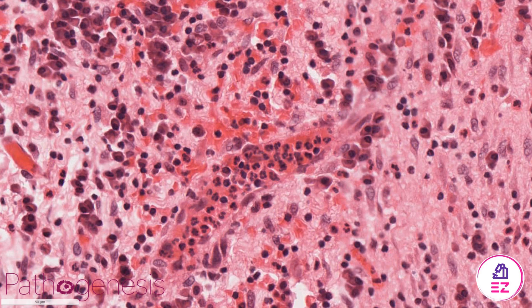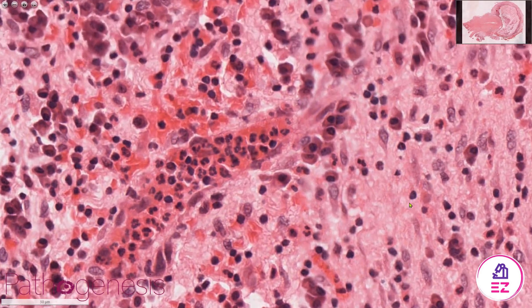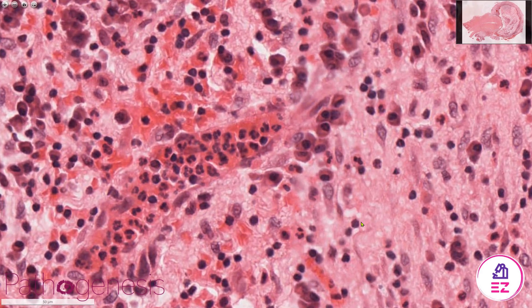The first cell we're going to cover is the lymphocyte. These are essentially little black dots — not very exciting in terms of their appearance. You can't tell if they're T or B lymphocytes on normal histology stains; you'd have to do immunohistochemistry for that. They all look essentially the same.